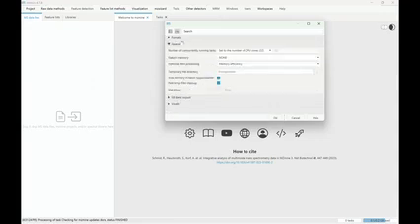In general, some important parameters are there, like the temporary file directory, and I typically put it somewhere on a fast local drive, because if we want to process a lot of mass spec data, it's quite heavy. There's a lot of data to be processed. We actually use memory mapping to speed up the process and be able to process thousands of files, like thousands of gigabytes, on a laptop or a data processing computer.